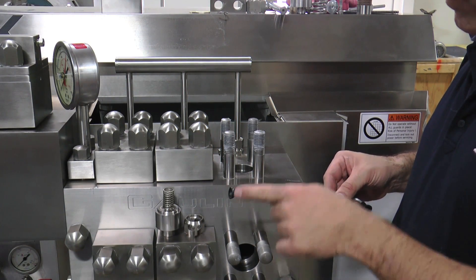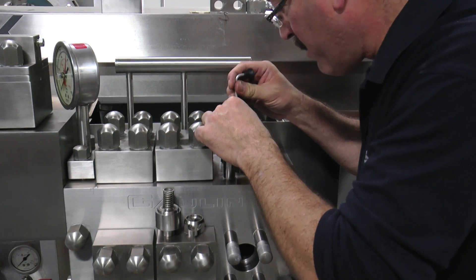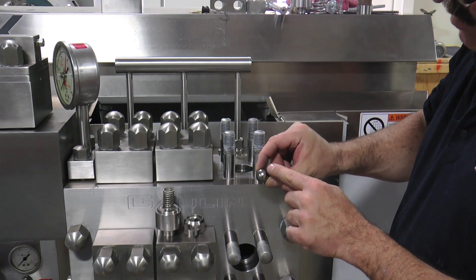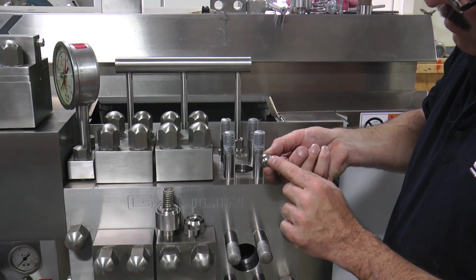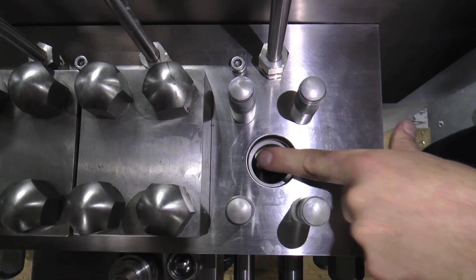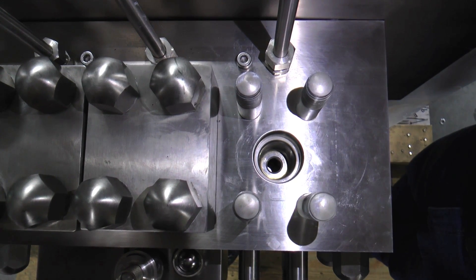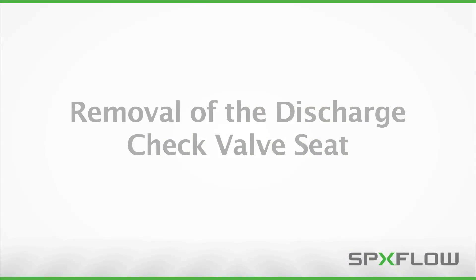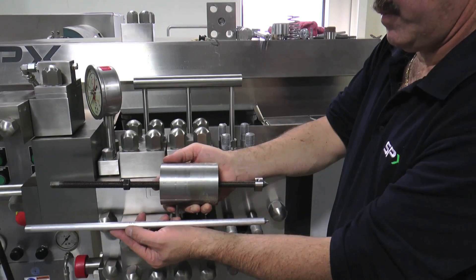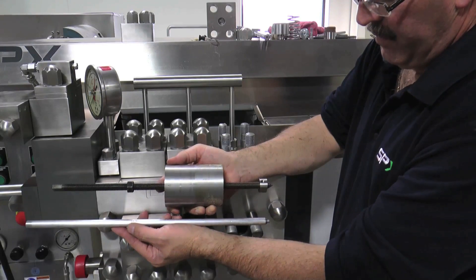To remove the check ball, use the special suction cup tool by inserting it into the bore on top of the ball and carefully remove the ball. Look for any signs of wear on the ball — the surface should be very smooth with no signs of pitting or scoring. Inspect the gasket and replace it if there are any signs of wear. Inspect the check ball seat for any scoring. The seat removal tool, which includes a puller and an aluminum extension rod, will now be required. Do not remove the seat unless you are planning to replace it.